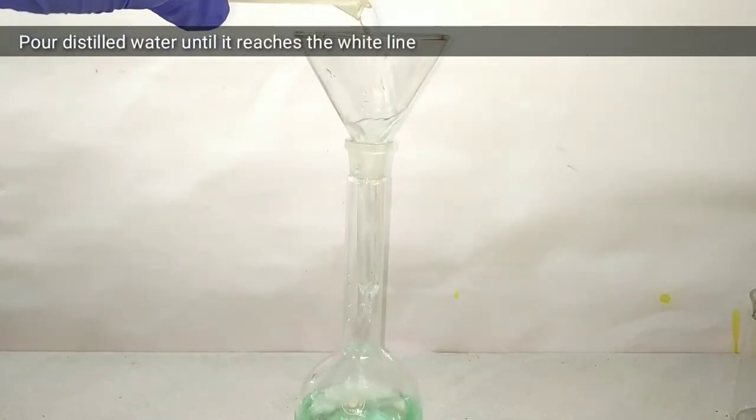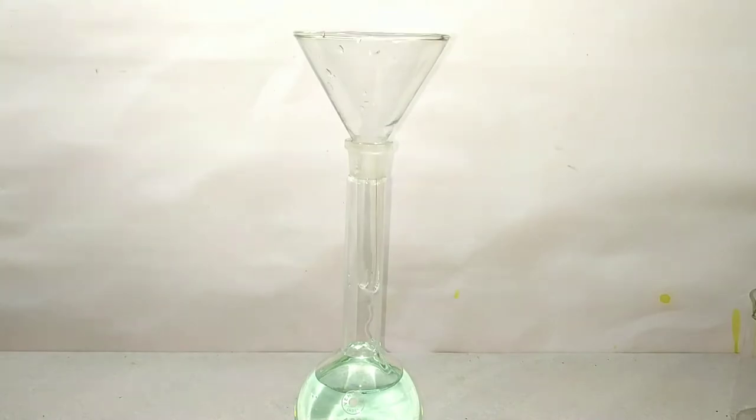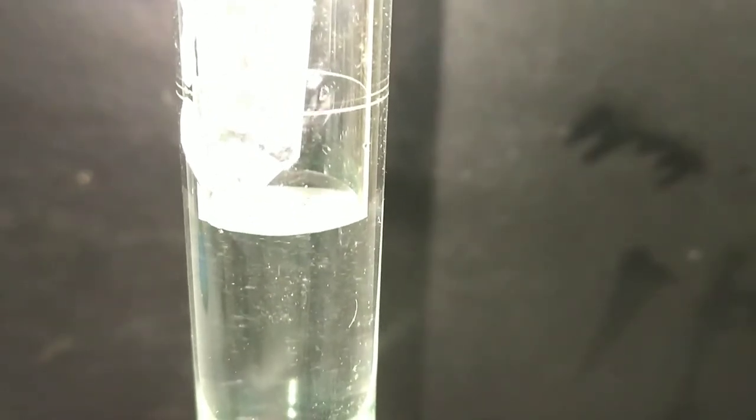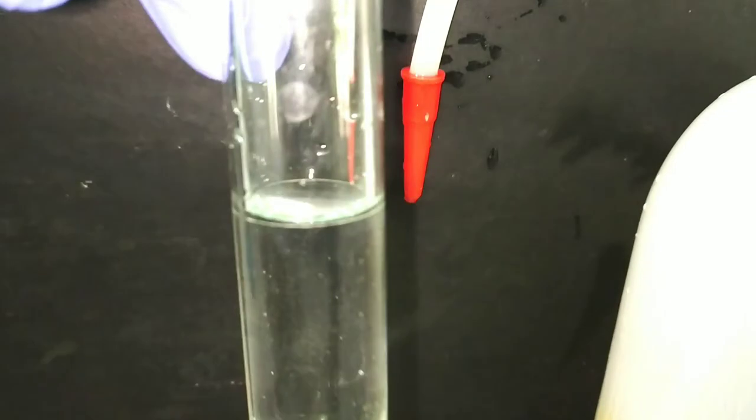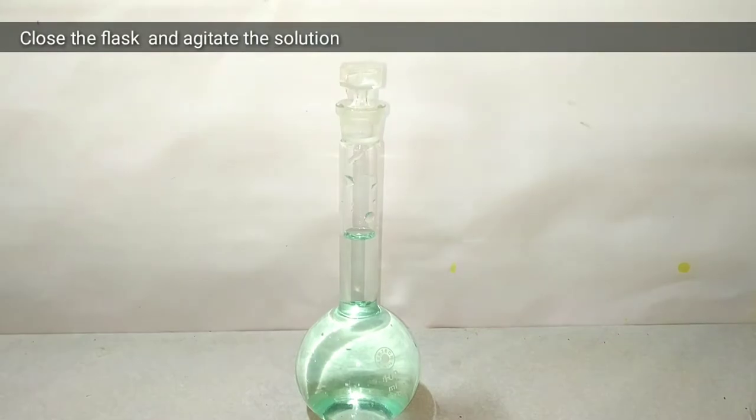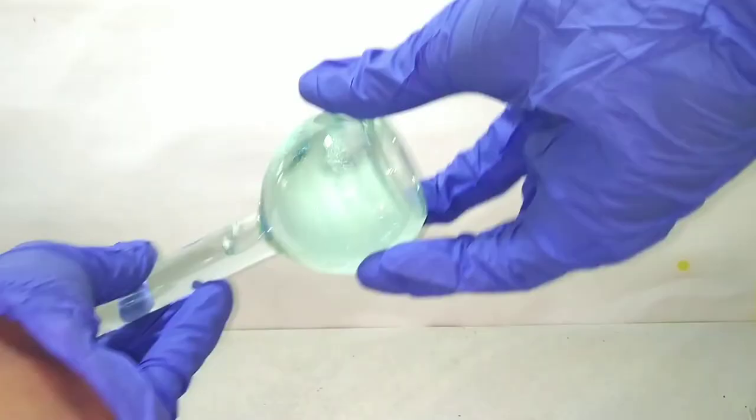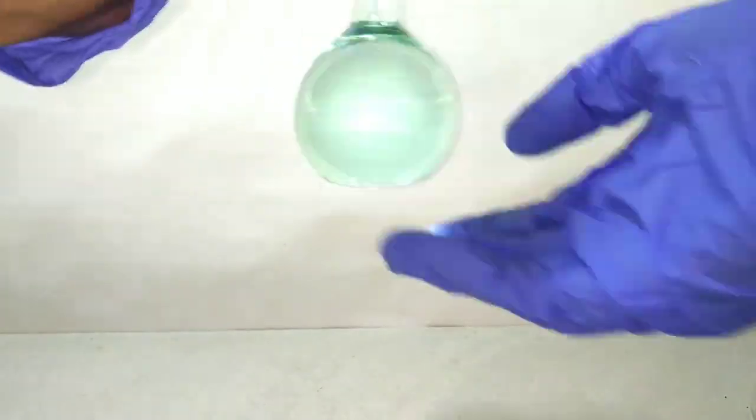Now we pour the distilled water into the volumetric flask until the water reaches the white line marked. When we reach the final part, we should be very careful and add dropwise the solution until it reaches the mark. We should read that by placing it at eye level to avoid the error of parallax. Now we cap the volumetric flask and agitate it to mix the solution well.